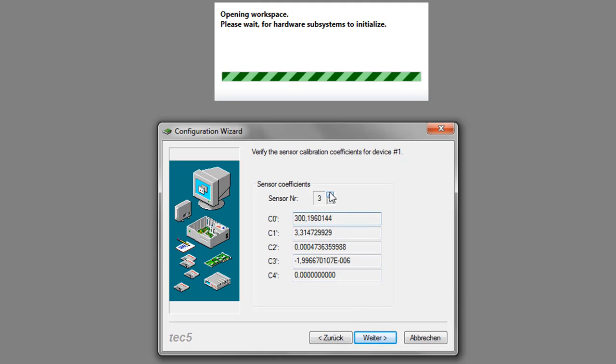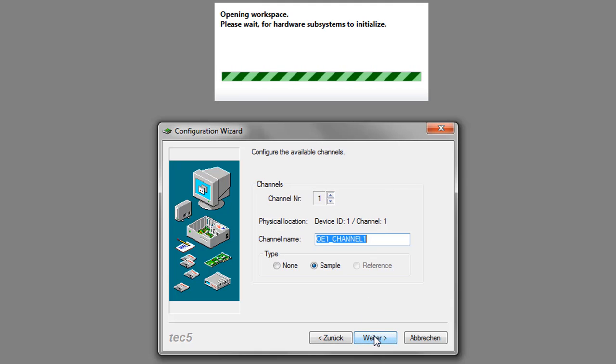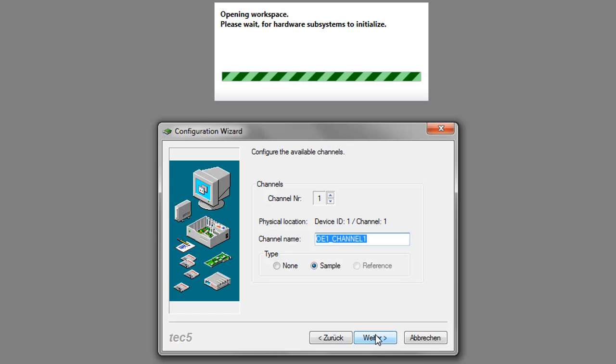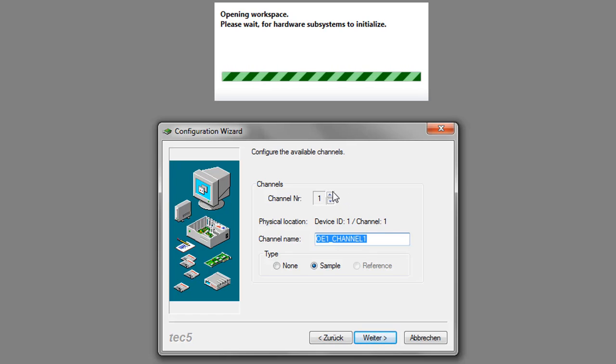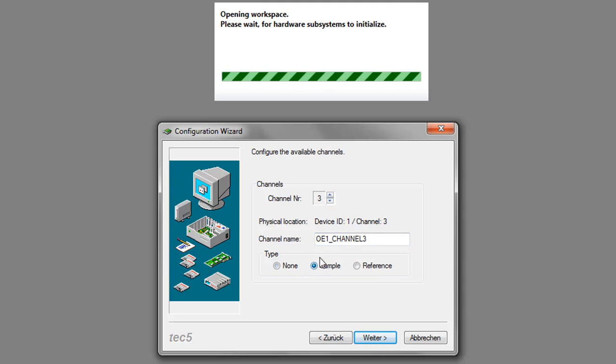You see all the sensor coefficients for each channel. And in the next step, you decide how you want to use them. I decide to use all channels except for channel 5 as sample channels.